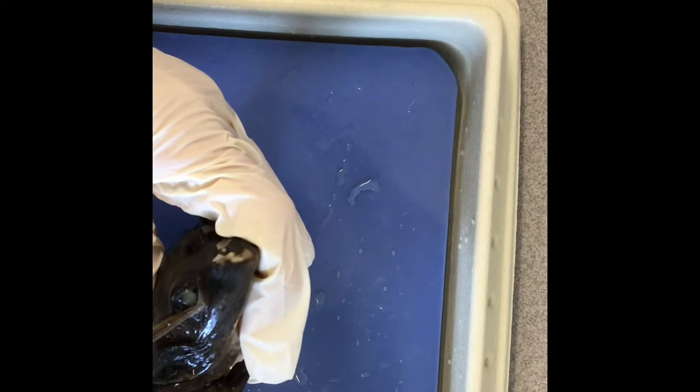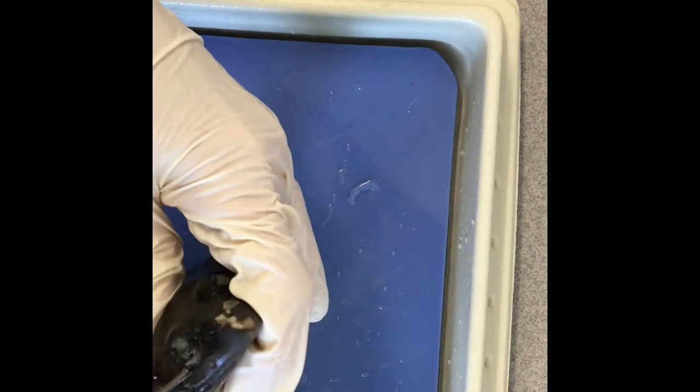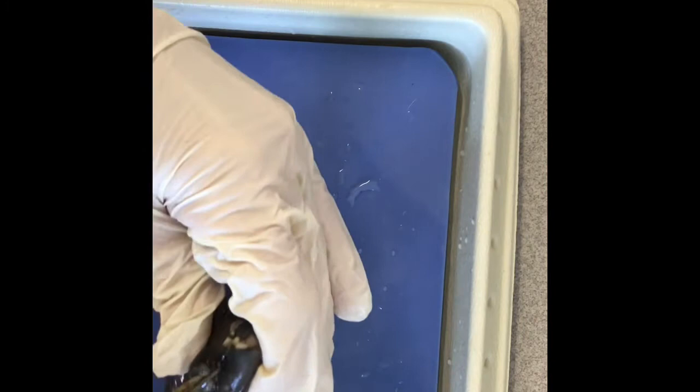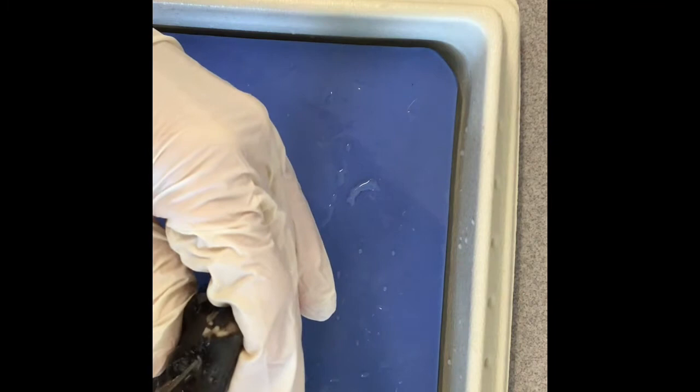I'm actually going to cut that membrane so I can take the lens out. The lens of the eye is inside here, so you kind of have to pop this membrane and cut. The lens can be a little bit tricky to cut out, but it's this hard, clear ball that helps the frog see.